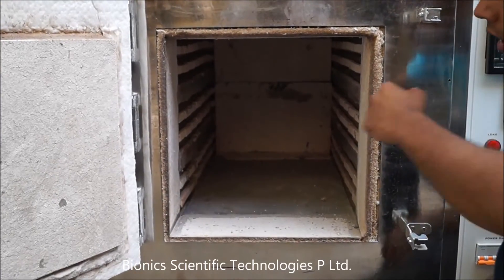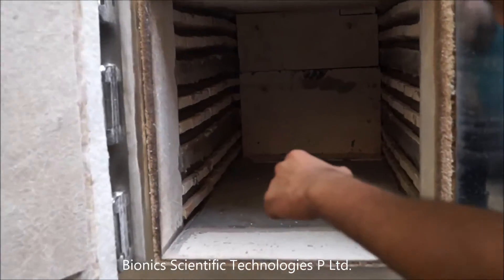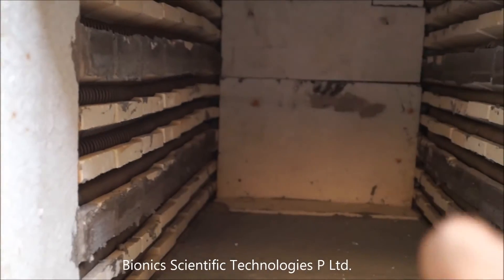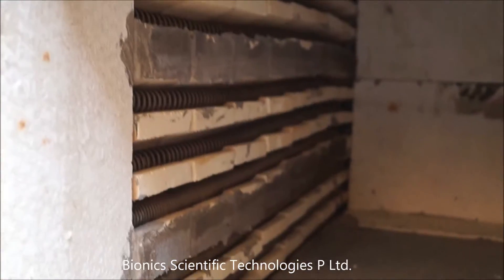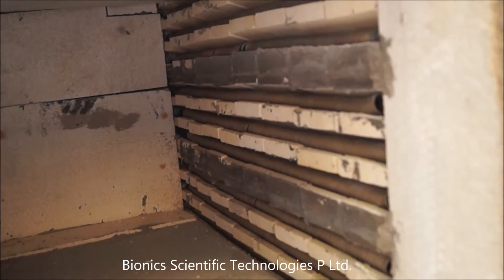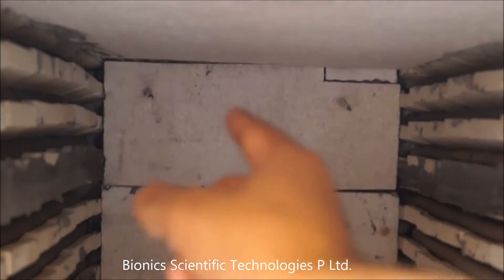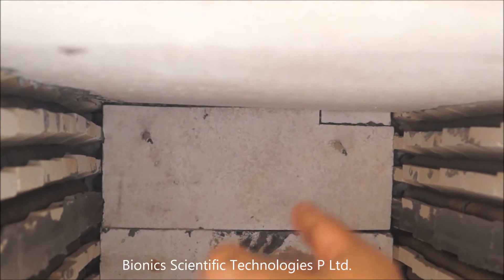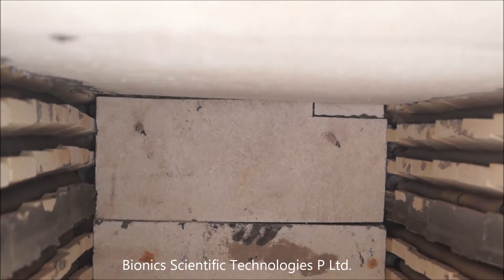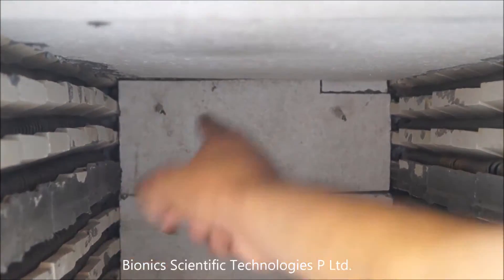What makes our Muffle Furnace different from other Muffle Furnaces is that it has a big wide area. There are heating elements on both sides of the chamber. The two little wires coming out from the walls are called temperature sensors.